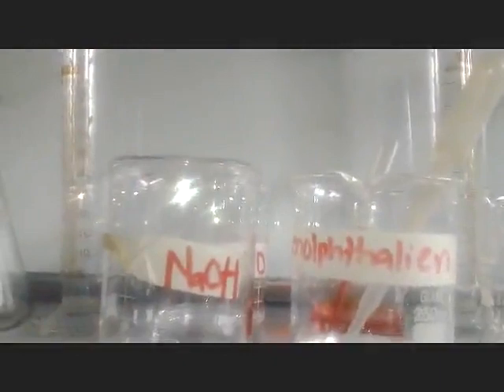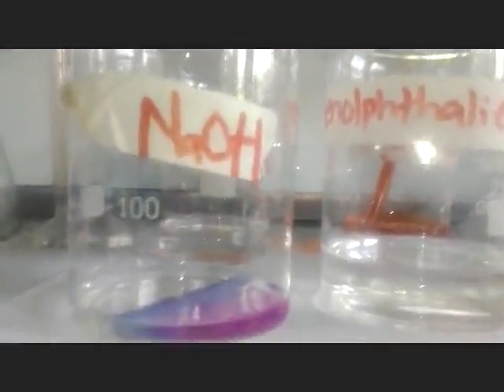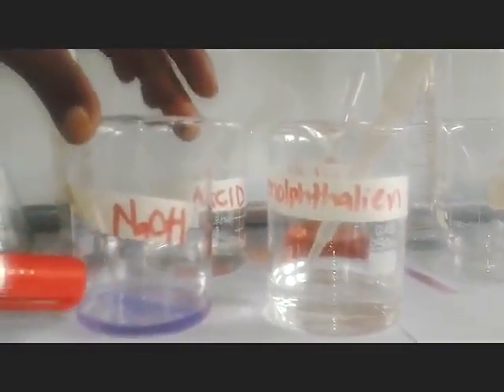Now, let me get my phenolphthalein indicator still, and put it there, and we see the behavior of phenolphthalein in this solution. Now I'm going to put a drop there. I'll put one drop. We can clearly see that when I put the phenolphthalein indicator in my base, or my sodium hydroxide, the solution is turning pink. Let me add more drops and you see.